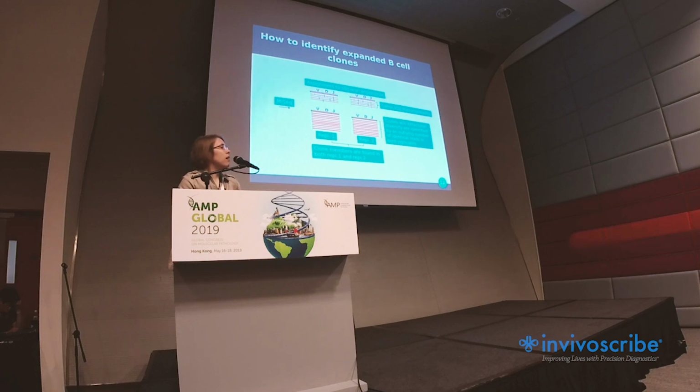This is easy if you have little mutations inside, but clones without intraclonal diversity are hard to find, because you want to collapse identical sequences, which can be the result of PCR amplifications or sequencing artifacts.